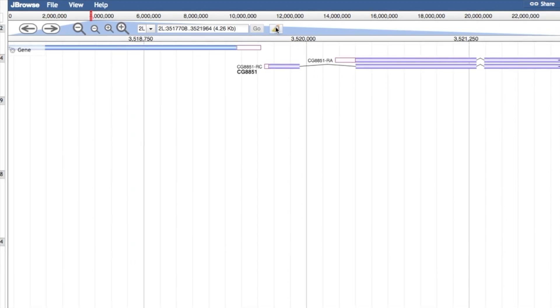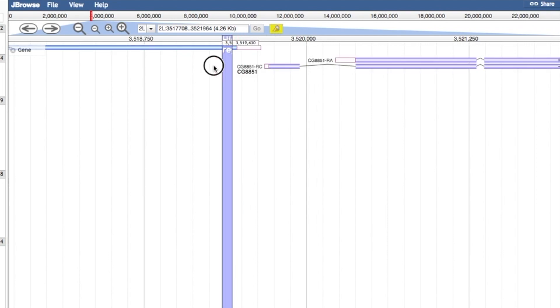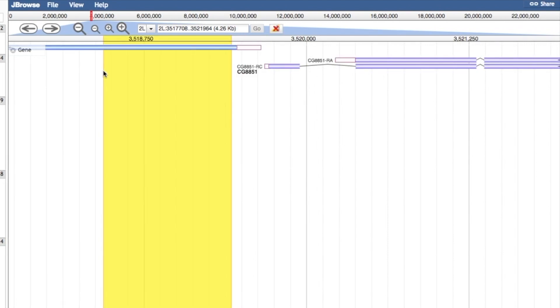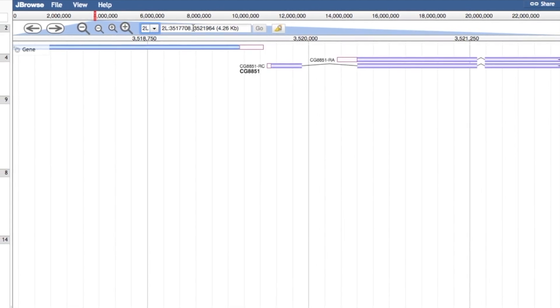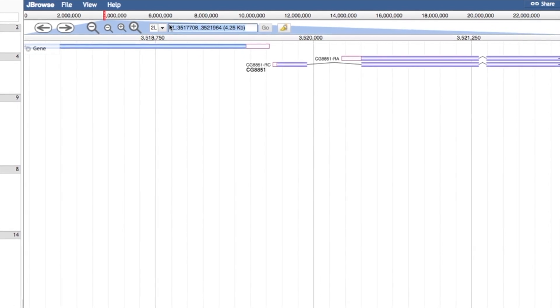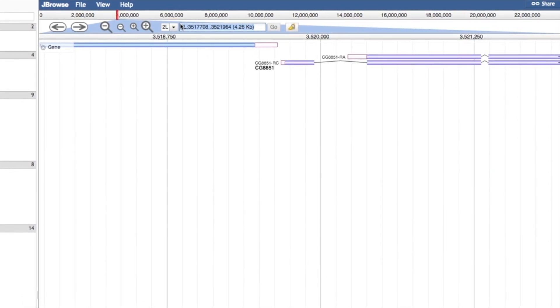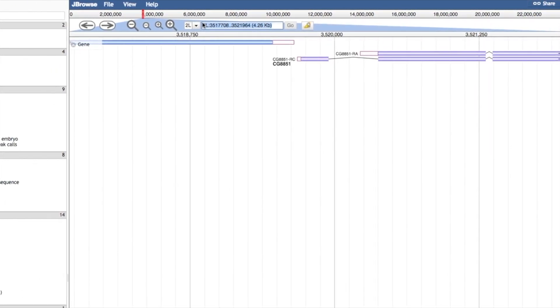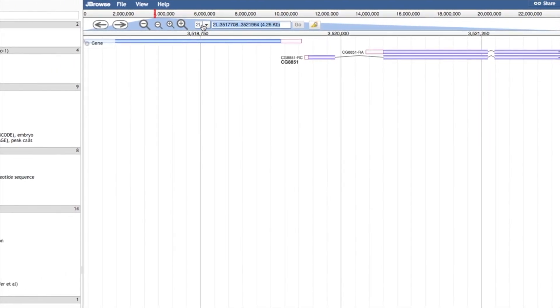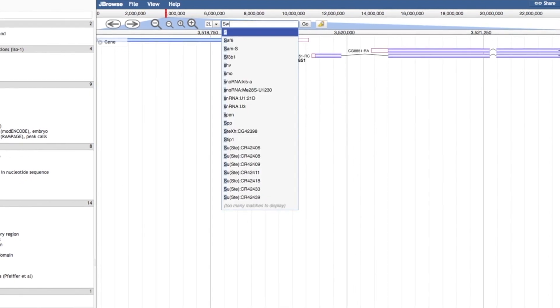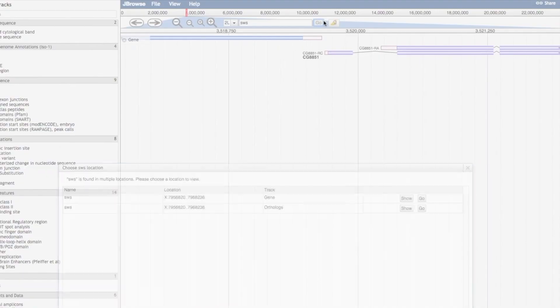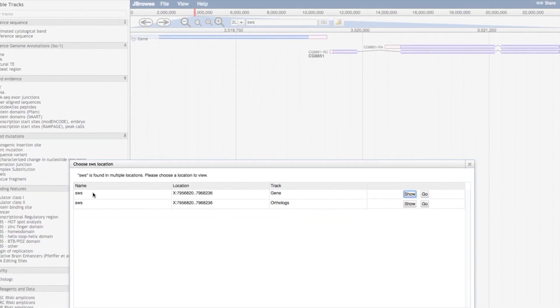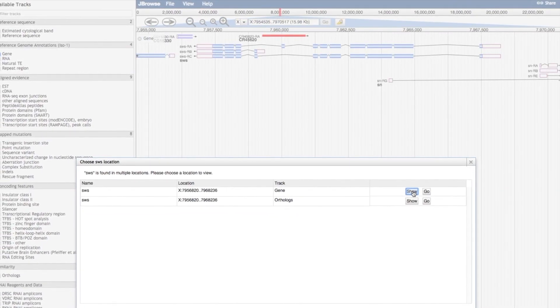The Highlighter icon allows highlighting of a region of interest on the viewer. This highlighting can be removed by clicking the icon again. There is a search panel that can be used to move to a desired chromosome region. Here you can enter a symbol, FlyBase ID, or a sequence location to navigate to.